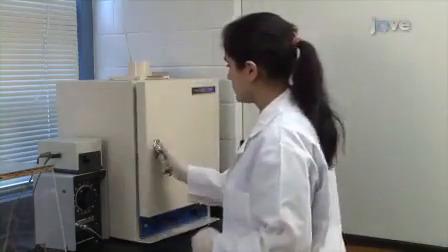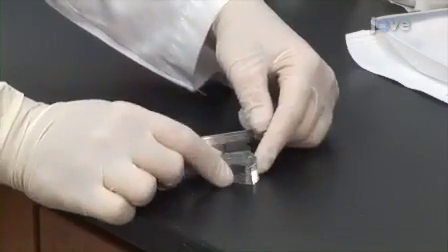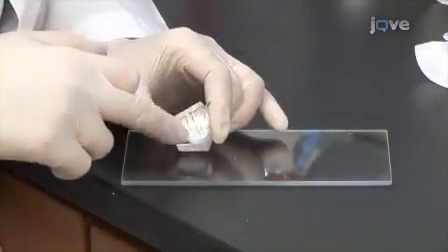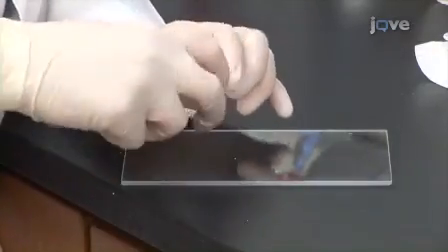Cure the degassed Silgard in a 50 degrees Celsius oven for about four hours. Once cured, cut the pedestal into a pentagon with a rounded top. Then secure the pedestal block to the rectangular plexiglass board with a thin layer of clear waterproof silicone adhesive.